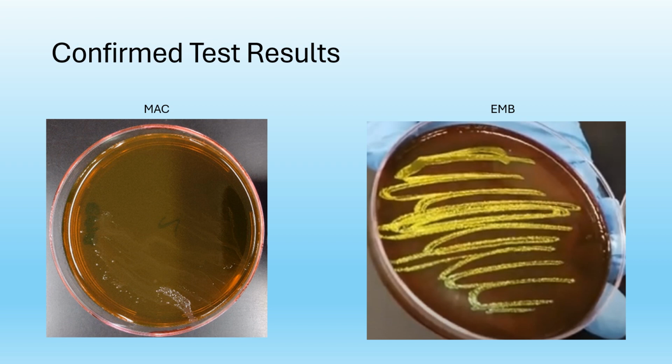Basically, don't drink this water supply. The water could be used for things like watering lawns, but it cannot be used for human consumption.